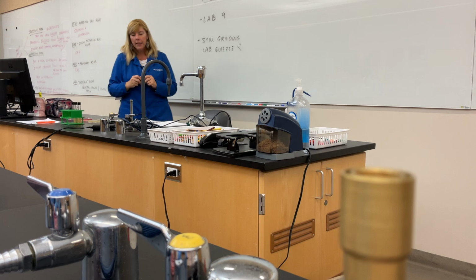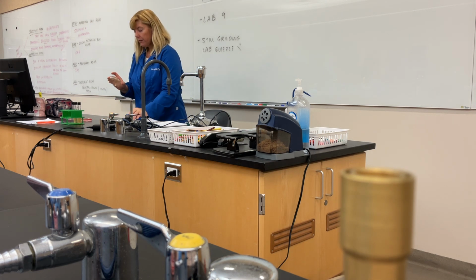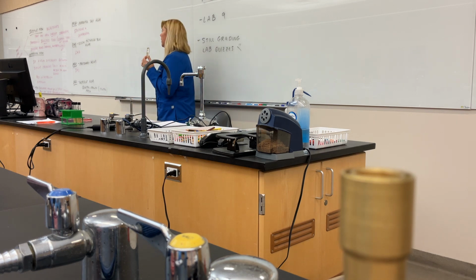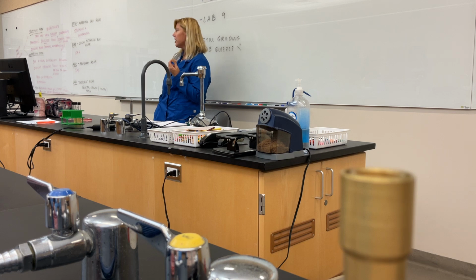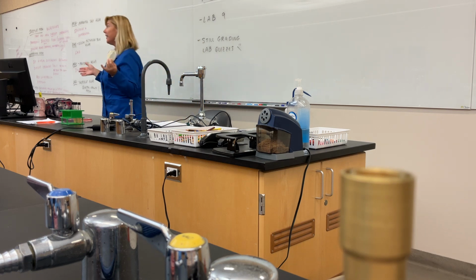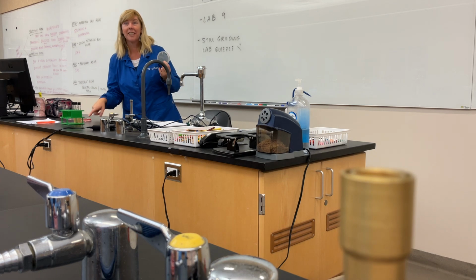But I will say this. The media that you're using today, you want to be very careful with. And what I mean by that is your bacteria are tattletales. If you set up the wrong microbe, they're going to rat you out because they're going to have a different reaction on the media than we expect to see. You can tell me, nope, I put E. coli on there, and I look at your plate and it's all, I'm staph, and I can tell it's staph because of its reaction. They will tattletale on you. They'll be like, I'm not E.